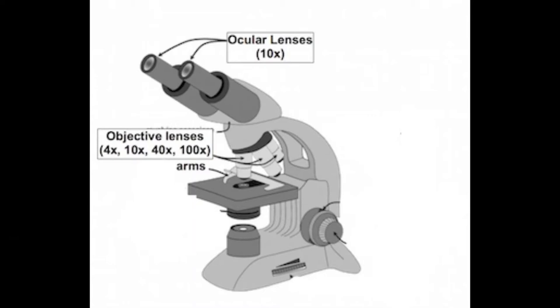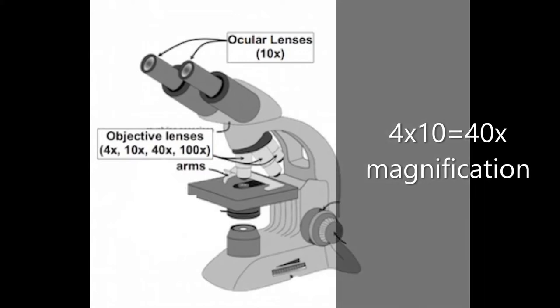Take a look at the ocular lenses. They also have the magnification written on them, 10 times magnification. So this means when you're looking at a slide under the scanning objective lens, you're seeing it at 40 times larger or 40 magnification.